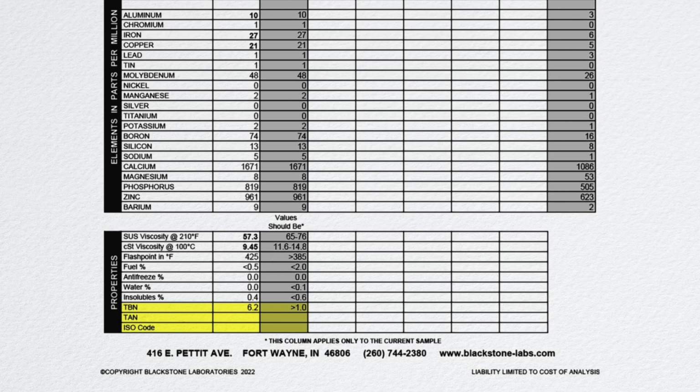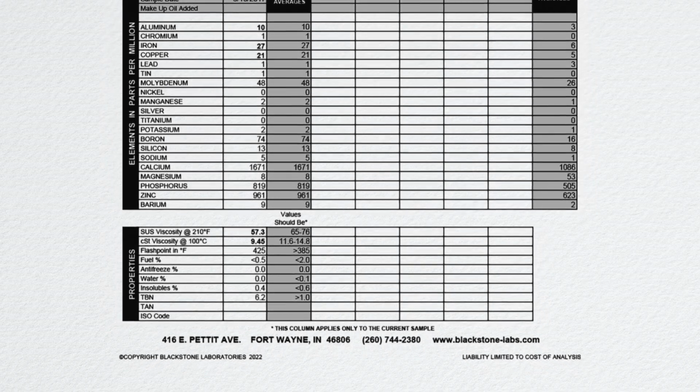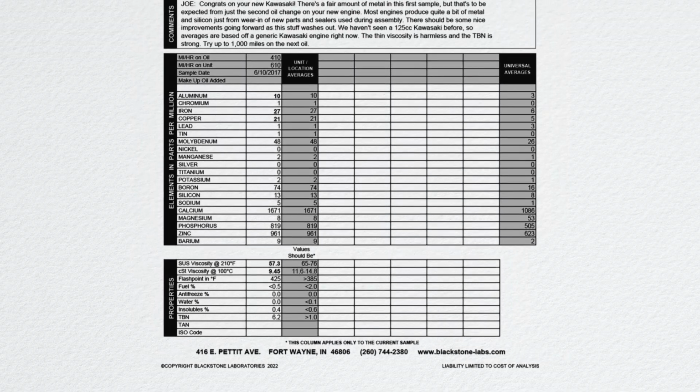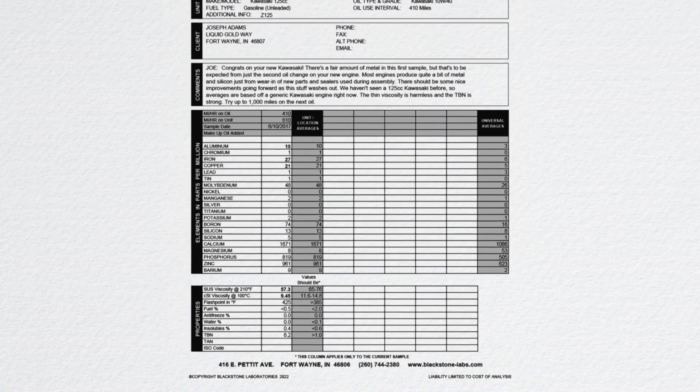Each individual test will be reported on the page and will include the result in the comment along with the necessary commentary that applies to that result. Again, think of the comment box as your guide. If we have not mentioned a particular result in that comment box, then you can be sure it's not a glaring concern. It's nothing that we expect you to correct on your own. And in the comment, we will leave you with a direction to go.